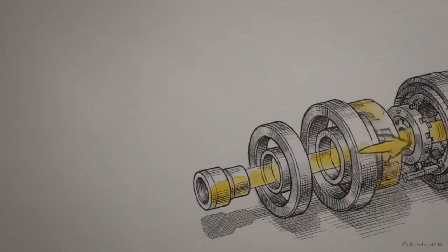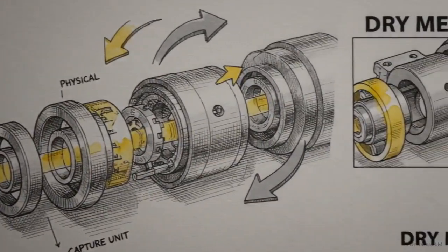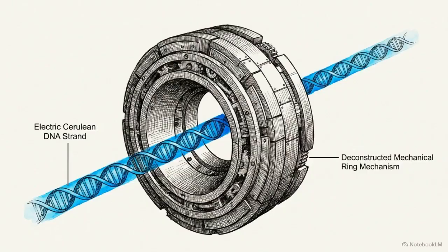The continuous evolution of nanopore technology ultimately demonstrates that capturing the genome does not require synthesizing better chemistry. It relies on engineering precise physical sensors to read the molecular blueprint exactly as it exists.